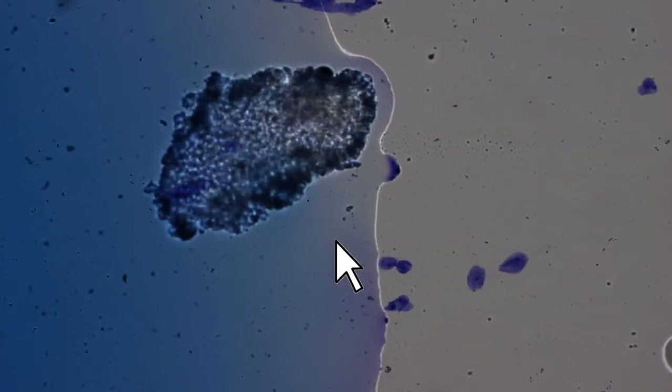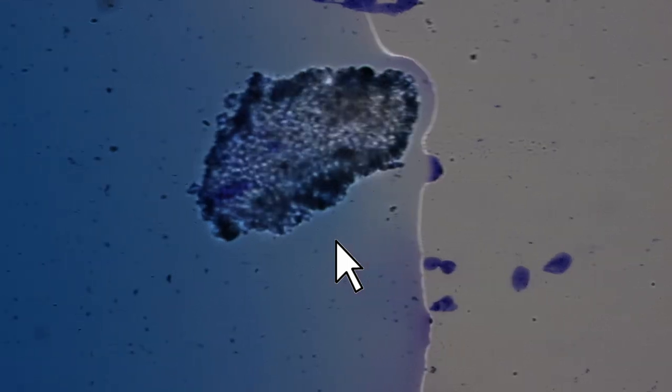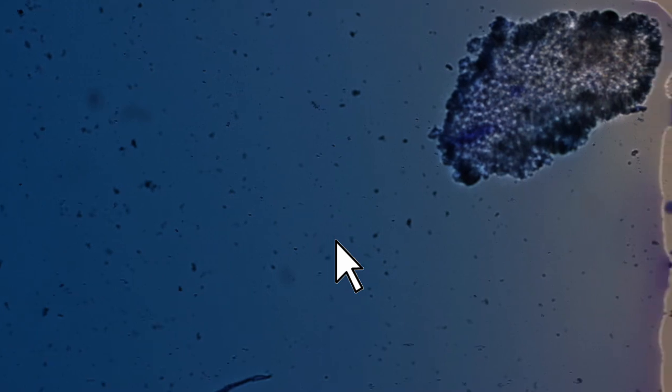Yeah, so that's very clear here, all of this place here. And why does this look so strange here? Okay, problem solved. Basically I got some methylene blue on top of the cover glass, okay? So over here there is no cover glass, methylene blue on top of the cover glass. So I spilled some stuff on top.